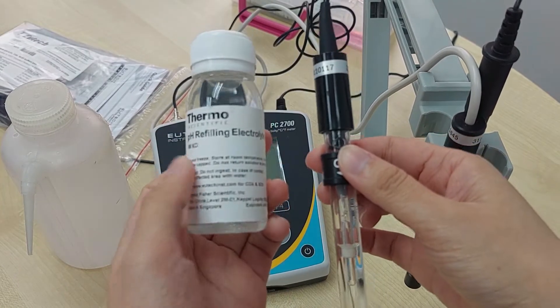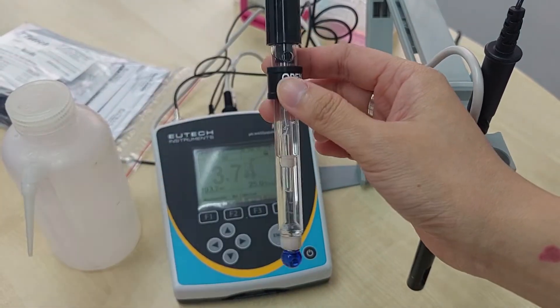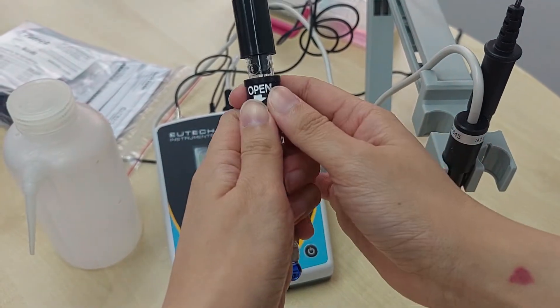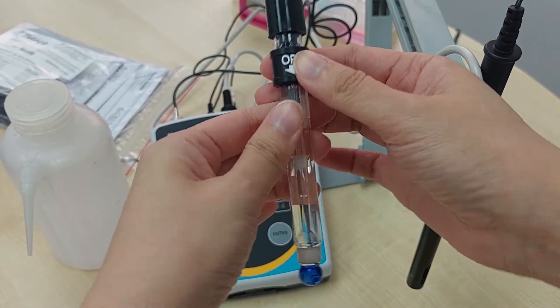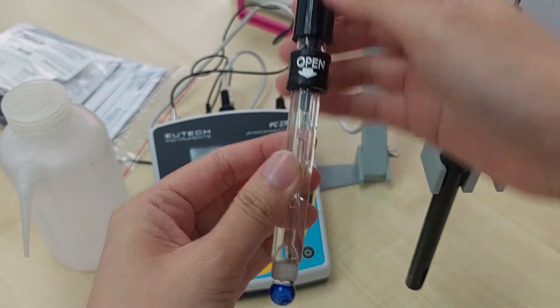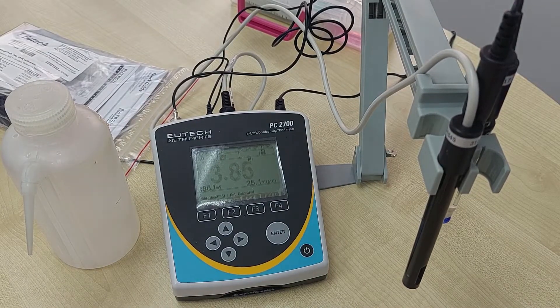They will provide a syringe and pH refilling electrolyte in the meter kit as well. You have to make sure the solution is up to the hole right here. During measurement, we leave it open like this to increase the flow rate of the electrolyte, so you will get a faster and more stable reading. Now we will proceed with pH calibration.